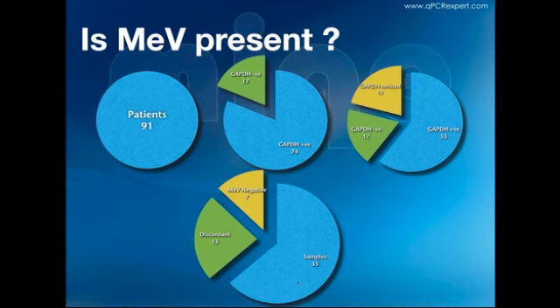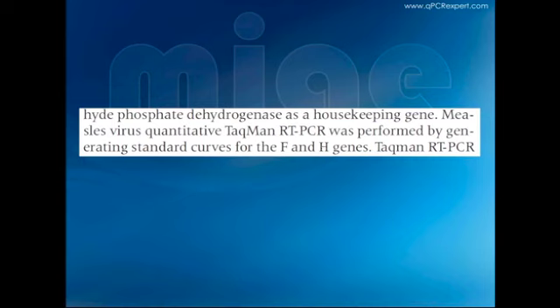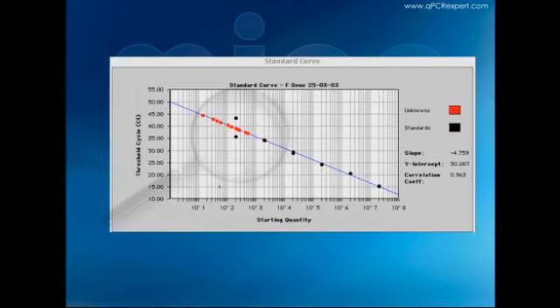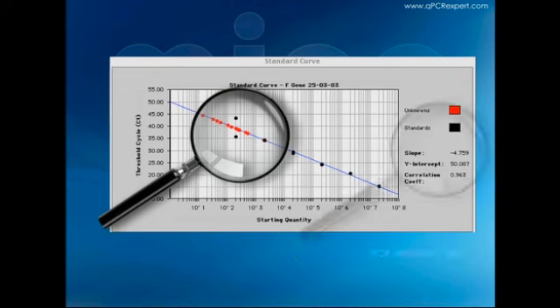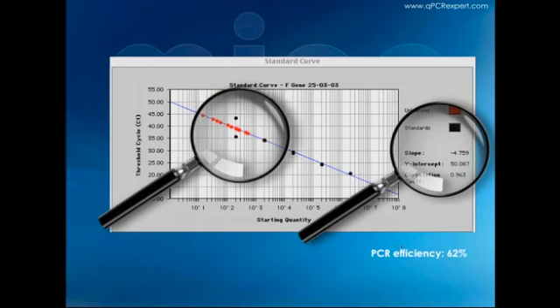They used standard curves for the F and H genes. But looking at their standard curves, two things are immediately noticeable. First, their unknowns map outside the range of the standard curve—the limit of detection is somewhere between 2,000 and 20,000, and these unknowns are outside the limit of detection. This is not an acceptable standard curve, certainly not for a diagnostic assay. Second, the slope gives a PCR efficiency of only 62%—meaning either their pipetting is poor or their assays haven't been optimized. Either way, this is highly problematic for a diagnostic assay.